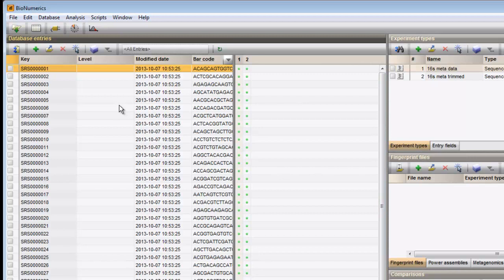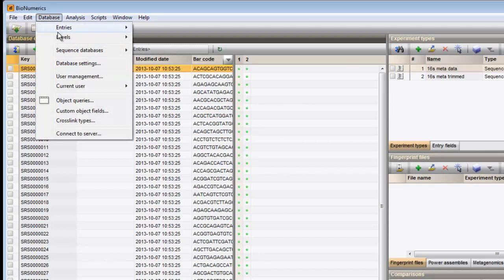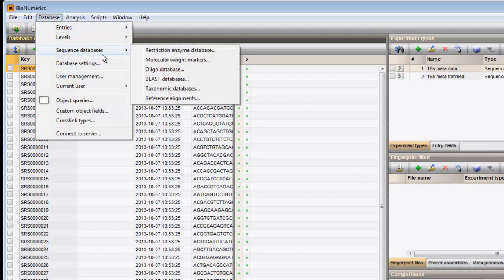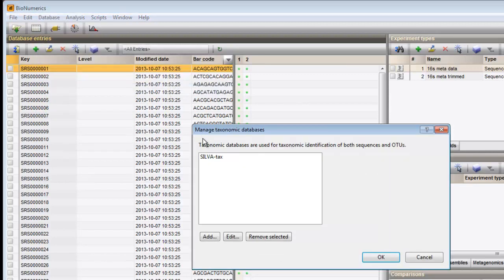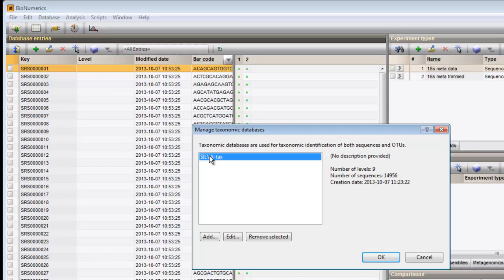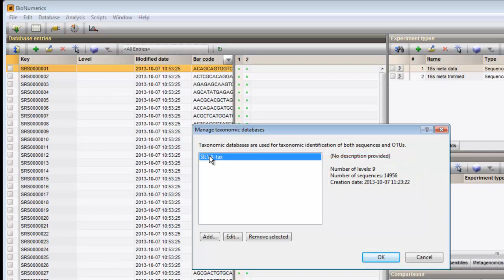Similarly, we will check the loaded reference taxonomy. Selecting a taxonomic database from the list updates the number of taxonomic levels that are defined and the number of sequences included.